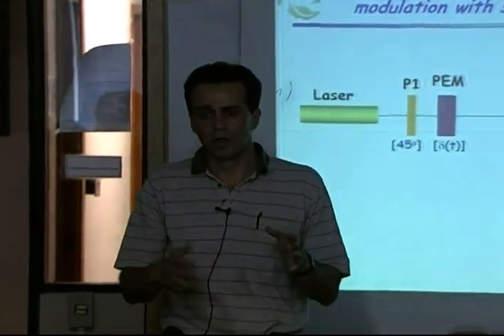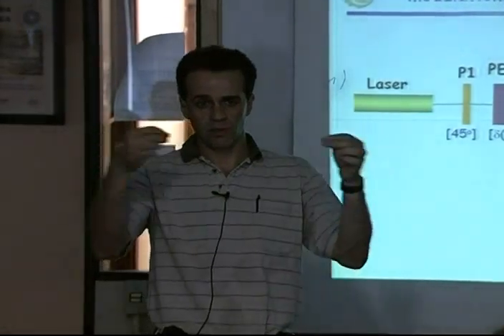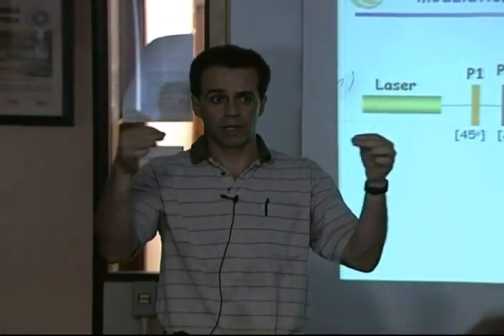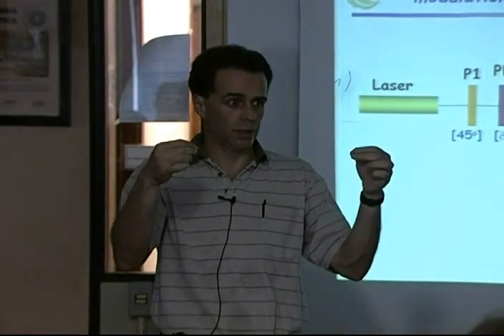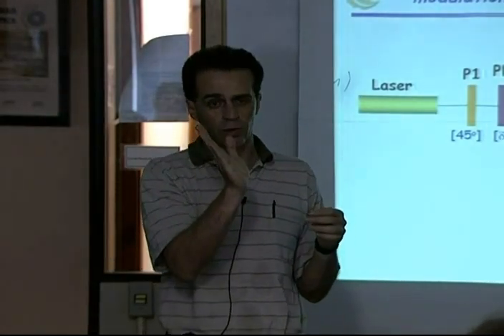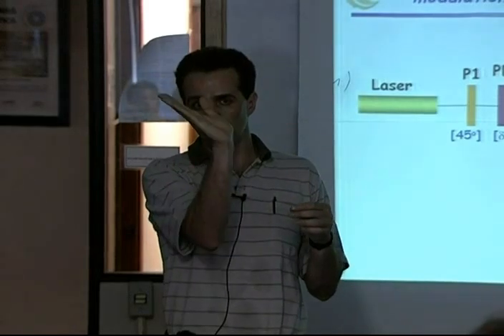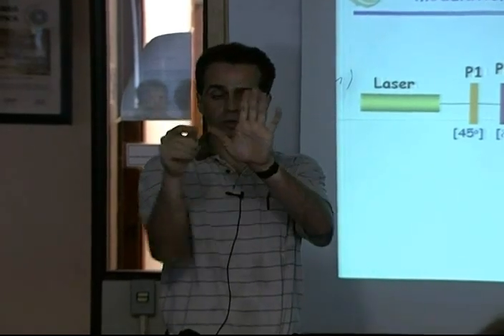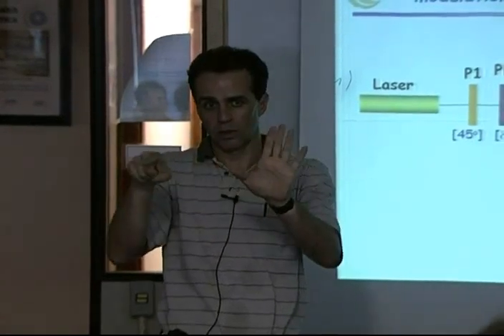It's similar to, say, an acousto-optic modulator. It's basically a piece of quartz that is birefringent and vibrates, say, at 50 kilohertz or 100 kilohertz. And so what happens if you come in with linearly polarized light into this piece of quartz, say at 45 degrees, and you can imagine the 45-degree light being decomposed into a vertical component and a horizontal component.